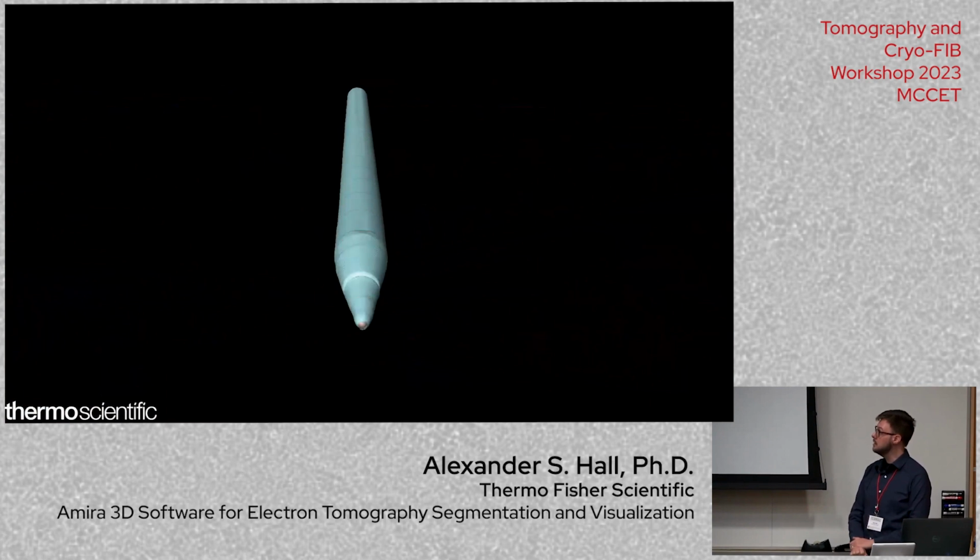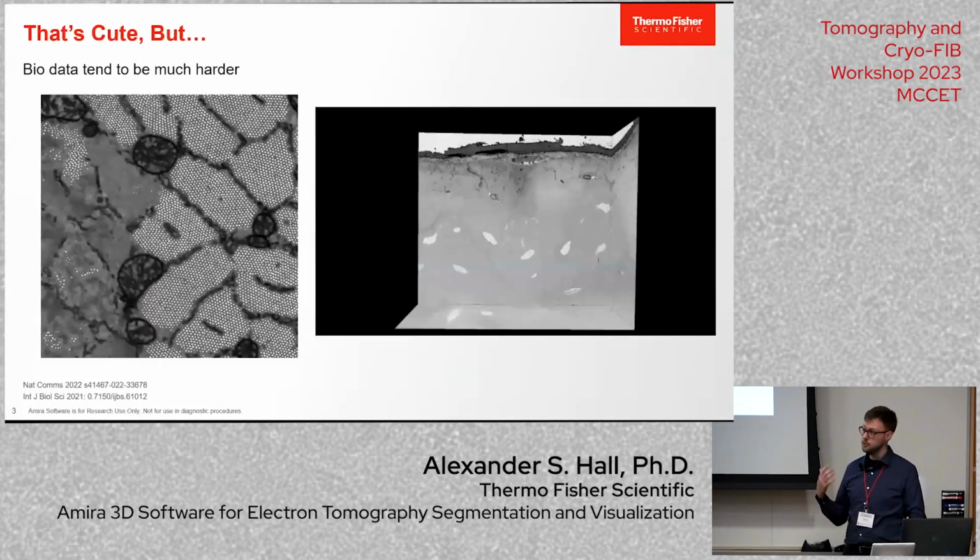I also show this to illustrate how, as a company that services multiple industries, we have powerful visualization technology that can be used for the life sciences. So that was from our material sciences focused product called Avizo. Now, to cater to the life sciences industry, we know as biologists or structural biologists, whichever, that our data are rarely so clean. You know, that's just a fact of life.